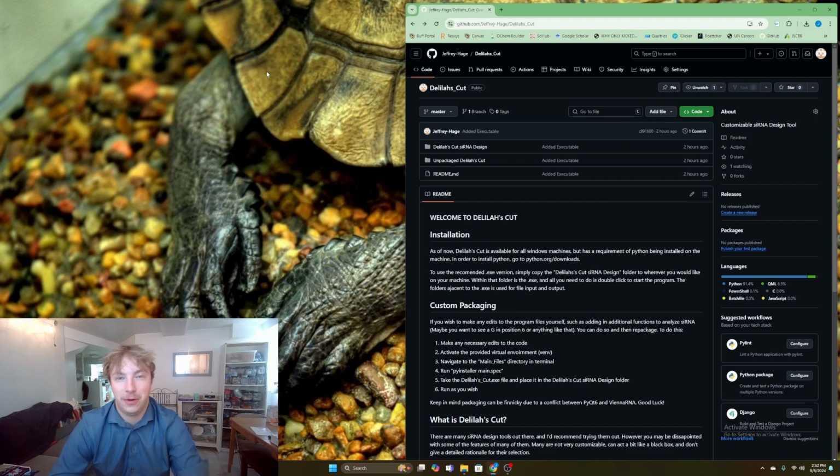Hello, this is a video for the tutorial of the program Delilah's Cut, where I'll be describing what it is, how to install it, how to use it effectively. Delilah's Cut essentially is an siRNA design tool that is meant to be as customizable to the researcher as possible, as well as transparent to what's going on as possible.